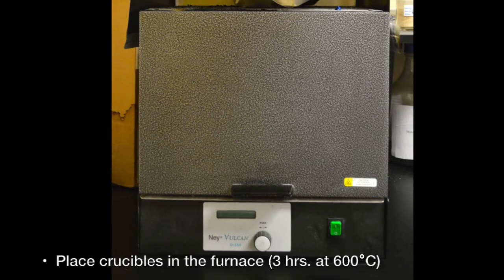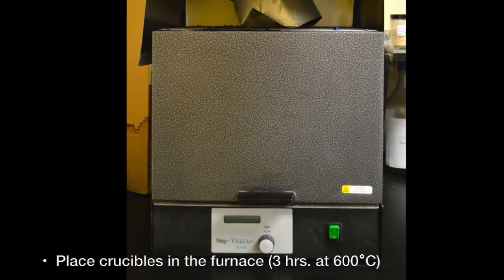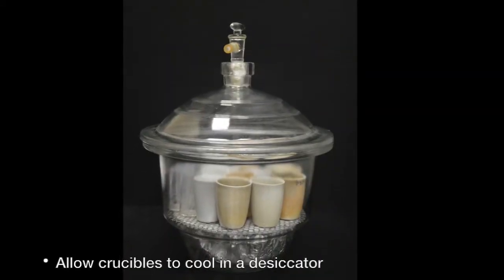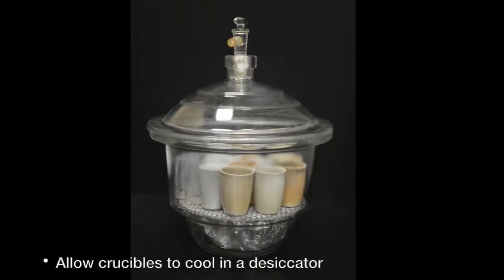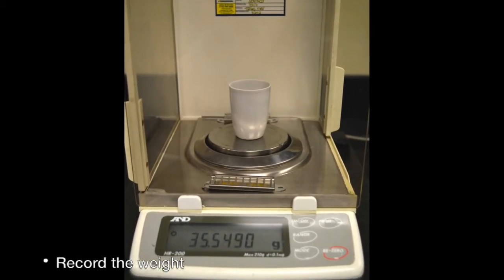Place crucibles in the furnace for three hours at 600 degrees C. Allow crucibles to cool in a desiccator. Record the weight of each crucible.